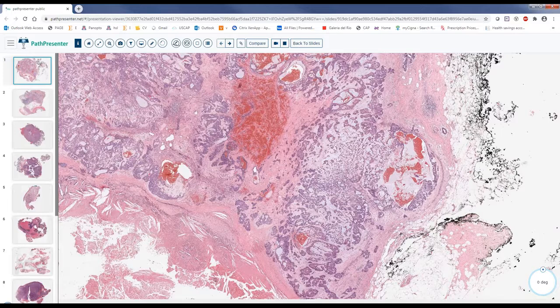Even though it's benign, it is discussed in the tumor boards. They bring the best surgeons to try to manage it, and the result still is not great. So this is one reason to try your best while you are grossing it: ink the specimen, really give the gross description, cut it well. Don't just make a cut in the middle and throw it. Do your best to give them this answer.